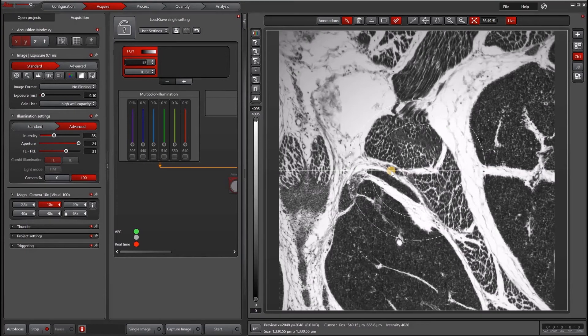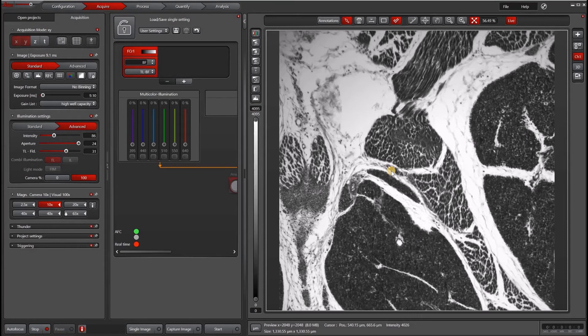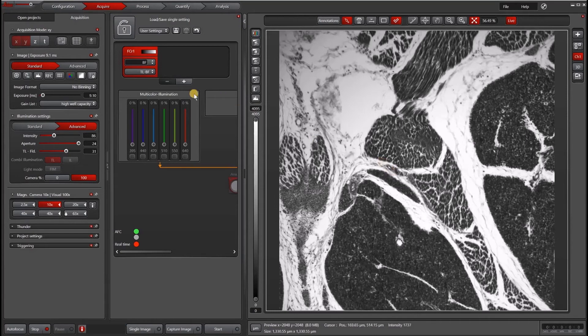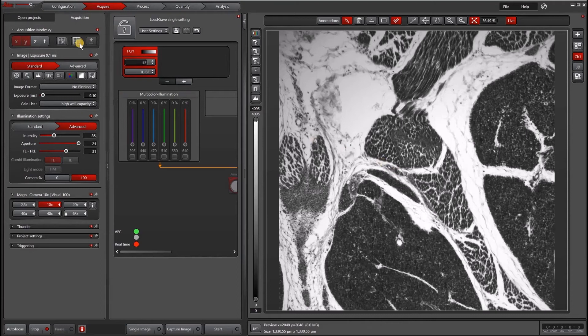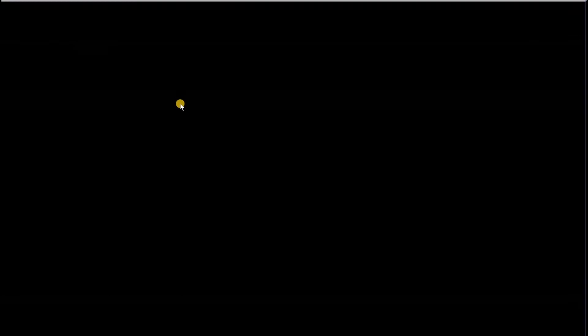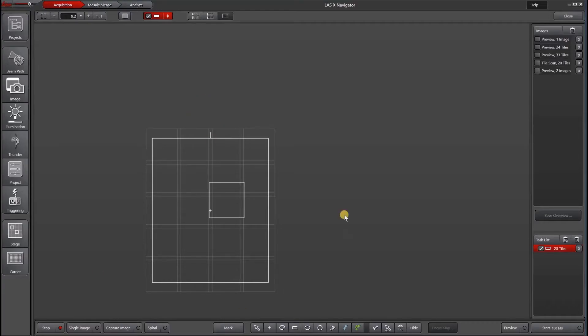So now that I have a pretty nice alignment, I'll hit Ctrl+T to get rid of my crosshairs. And I'll go back to navigator and check my alignment. So I'll go to this navigator icon and this is the area that I previously imaged.